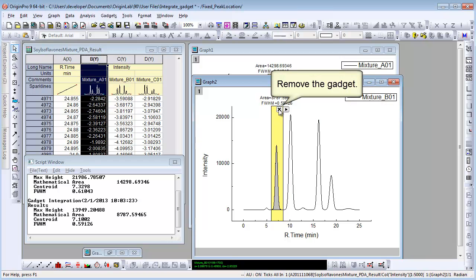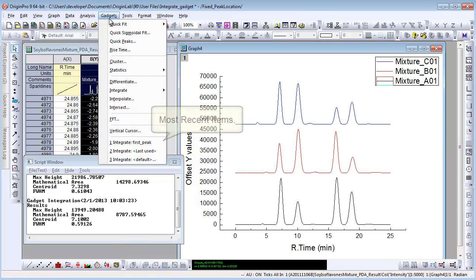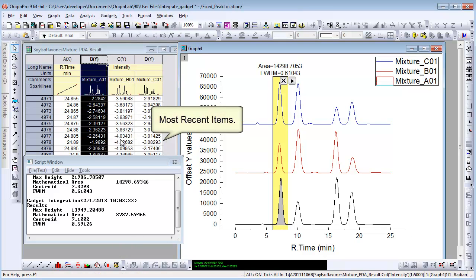Removing the gadget is easy. Just click the X button. Here is a graph with multiple data plots. Let's load the gadget from most recently used items list.